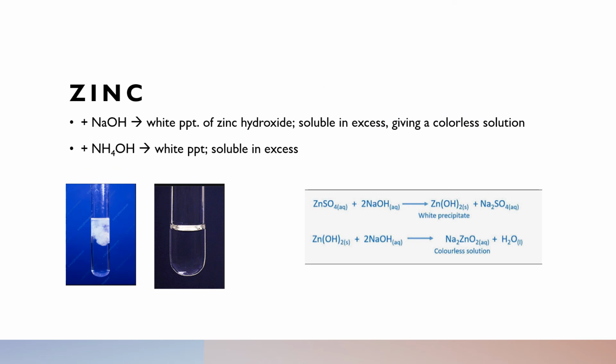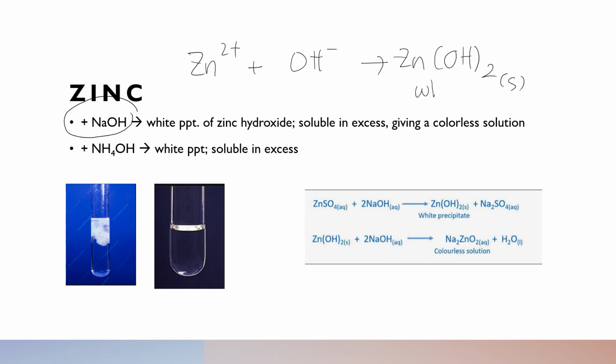Zinc ion, Zn2+, when we add NaOH, will react to form Zn(OH)2 precipitate, white PPT.